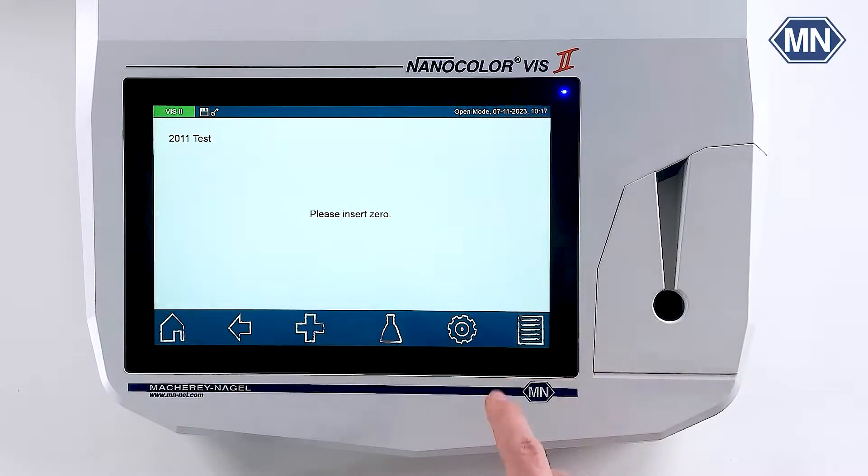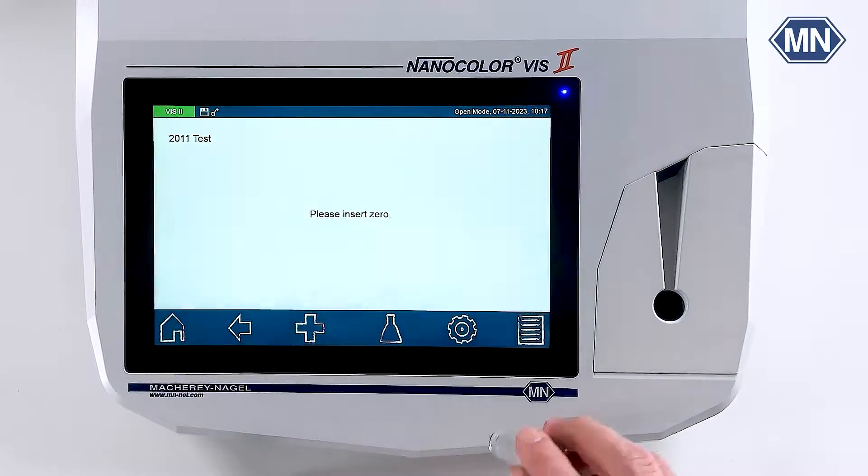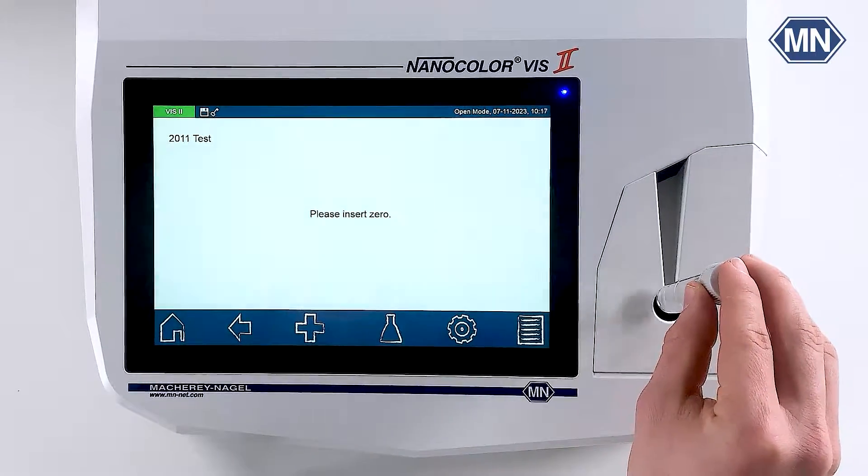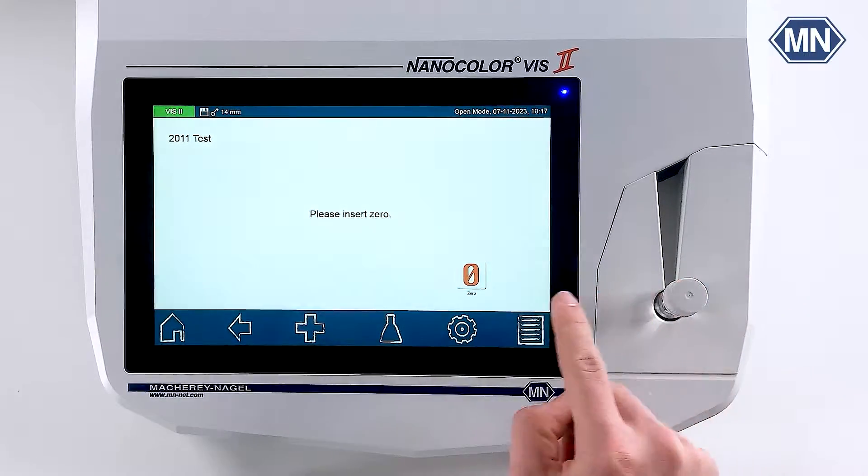After selecting the method from the favorites list, you can perform the measurement of your samples.